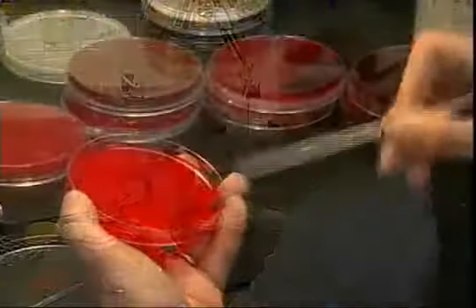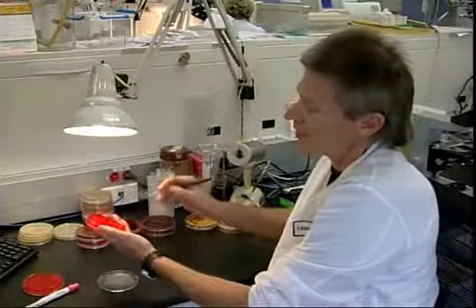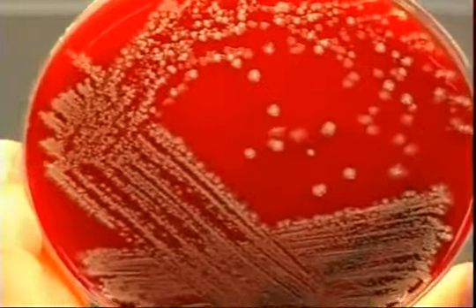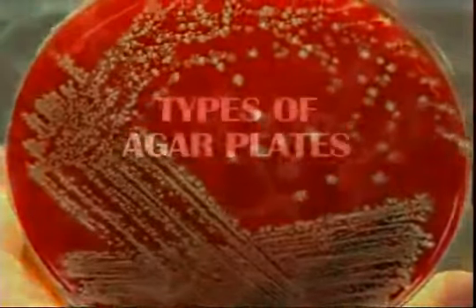Now you may wonder why we do this streaking technique. It's to spread the bacteria out, to find the specific pathogens. If I had a bag of, say, white marbles, but I was looking for one specific black one, the way to find it would be to take that bag, open it up, and spread those marbles out. Well, that's basically what we do when we streak the plate. We're spreading out the inoculum to find the specific pathogens that might be there. And as you can see, the material has been spread out, and what we have here is individual colonies. Now we can work with each individual colony and do testing on it.